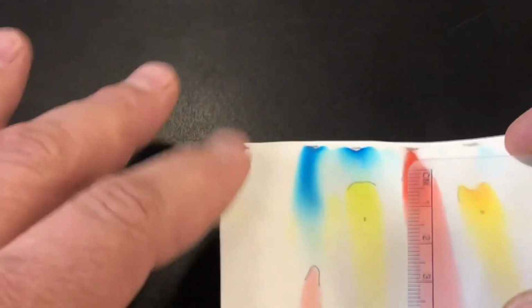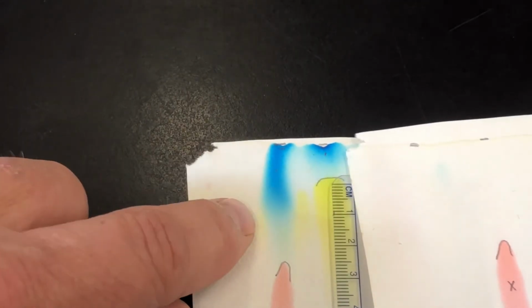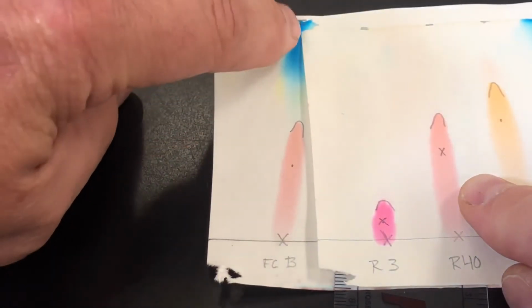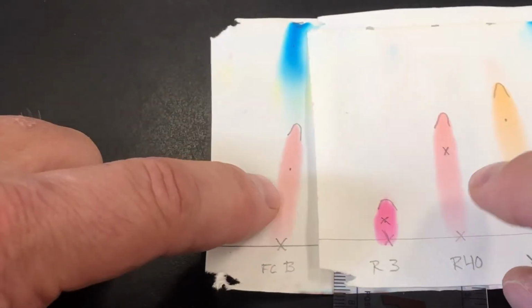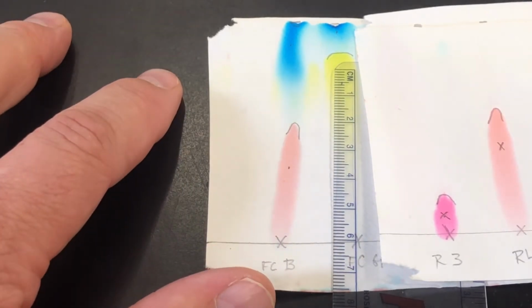Moving to the food colors. Now these food colors, we're looking at this. Well, if we match these up, we're going to see, look, well, the blue, our blue had a little bit of yellow in it, a little bit of red, probably not red 3, but oh my goodness, does it match up with the red 40? Tiny bit of yellow. The blue, FC food coloring, the Kroger food coloring had blue in it, probably had a little bit of red 40, and a tiny bit of yellow. Not this kind of yellow. It's probably that yellow number 5 that we could not get dissolved very well.